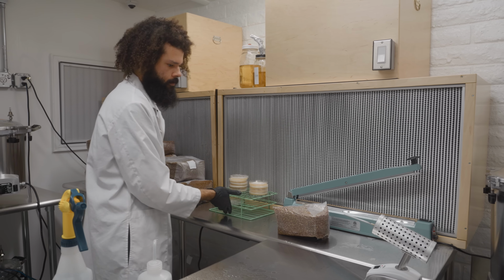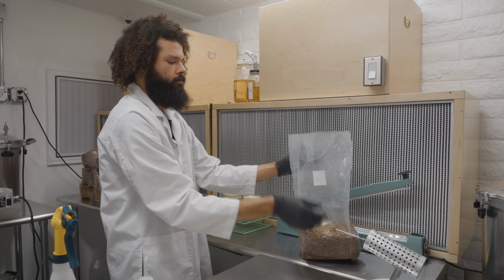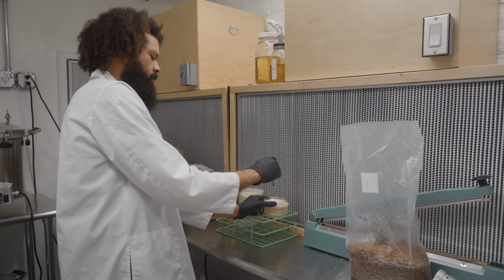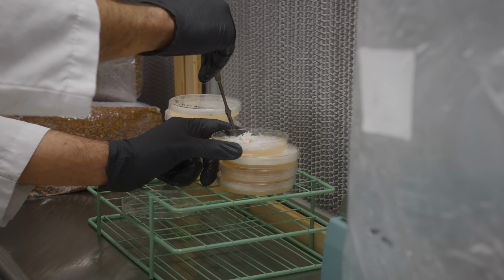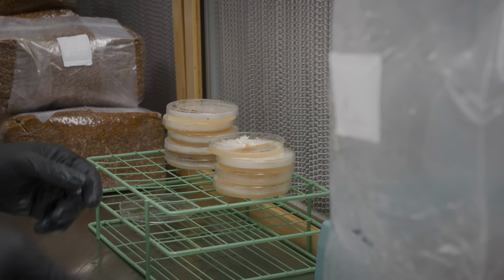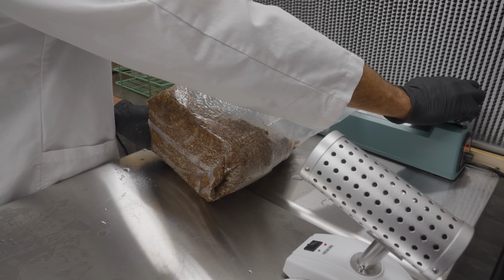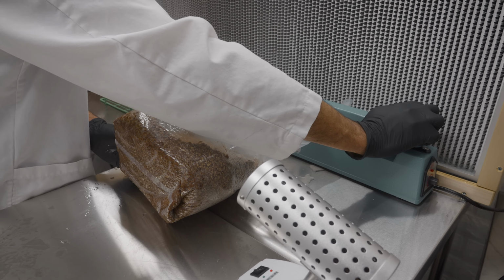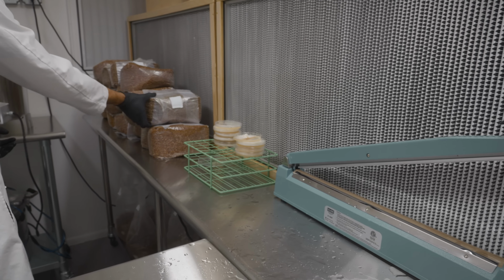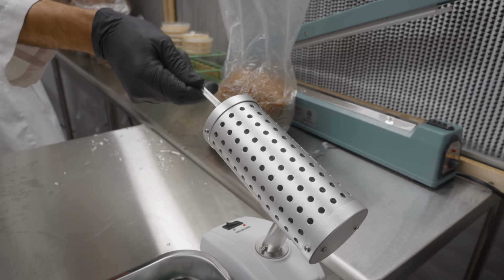Go ahead and remove the lid. I'll touch the scalpel right to the middle of the plate, and then just let it inflate with that sterile air. Check it for a quality seal, and I'll move that aside while I inoculate the next bag. Usually 10 seconds or so does it.